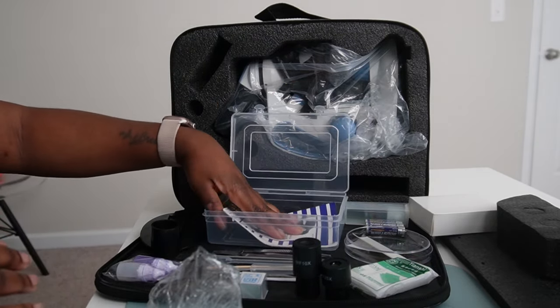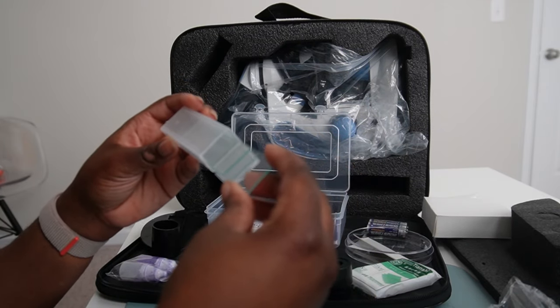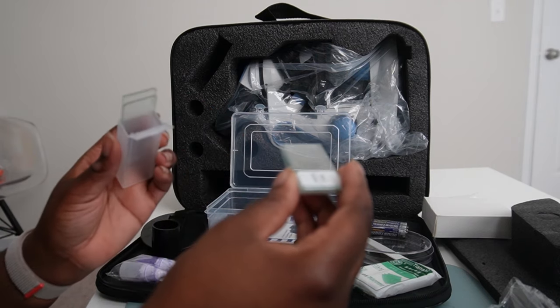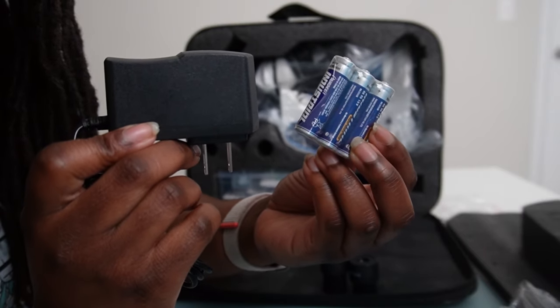So that's what comes with the kit. The first box is clear slides with nothing on them, just blanks. The second one, so we do have three slides to test today which I'm excited about. This microscope does have two options for power.